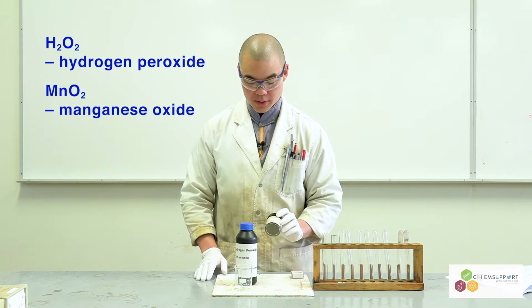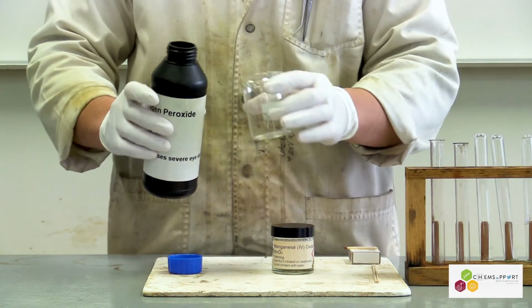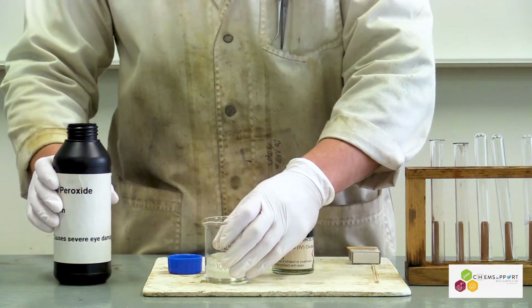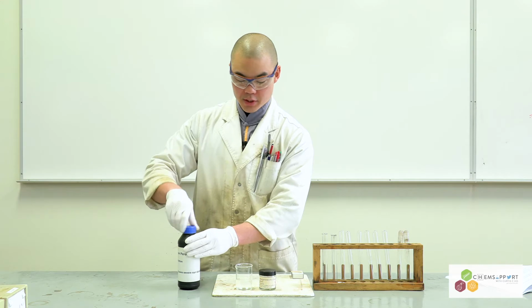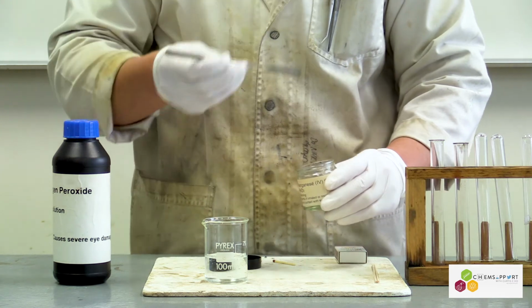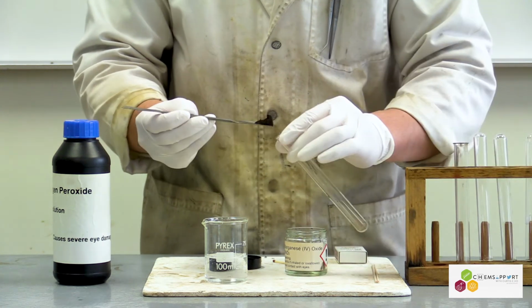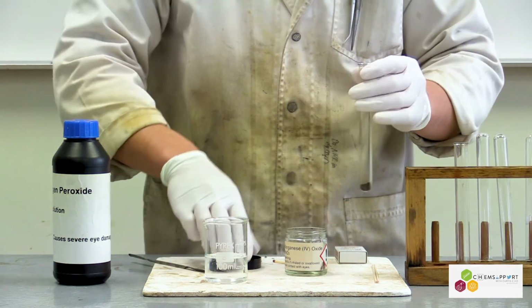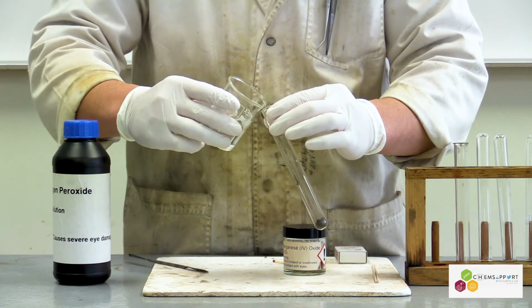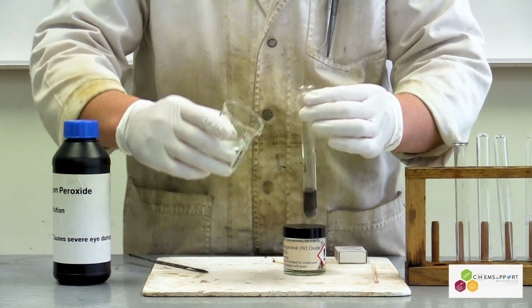manganese oxide, which is MnO2. We're going to pour out some hydrogen peroxide. It essentially looks just like water, but don't drink it because it's not. We'll get some of this manganese oxide here, put it into a test tube, and we'll see what happens. Manganese oxide is this fine, dark brown powder. Put it into our test tube. Close that up, add in our peroxide, and give it a little shake.